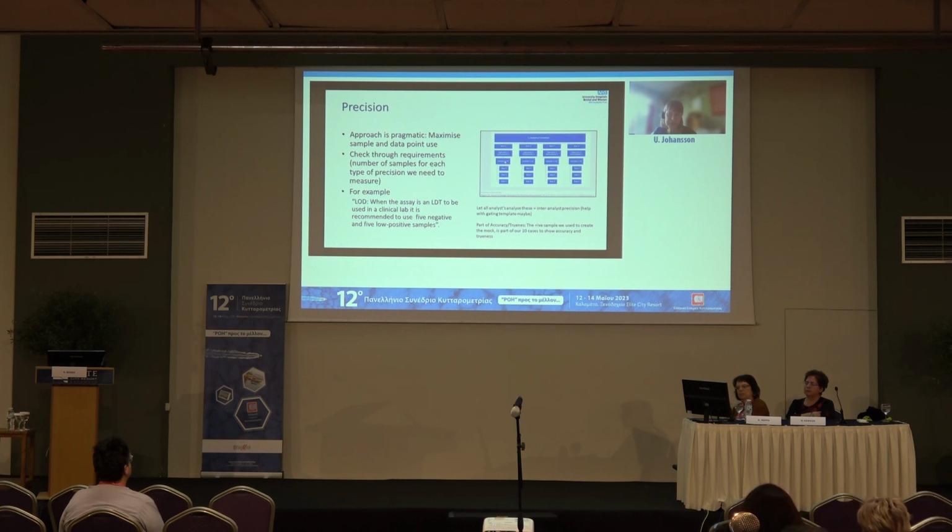And then they ran through the sample 3 times and maybe 2 different people analysed each individually. And then the next day or the day after, another person set it up and another person set it up. You run it on 2 different cytometers, 3 times per sample with different people analysing it.